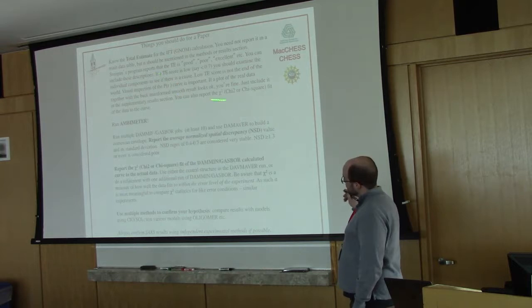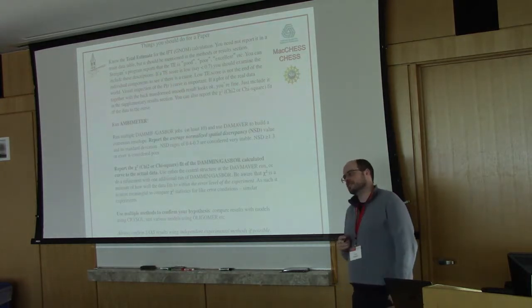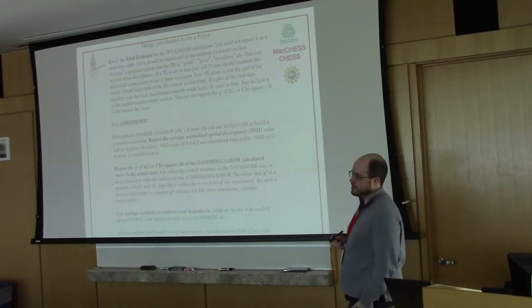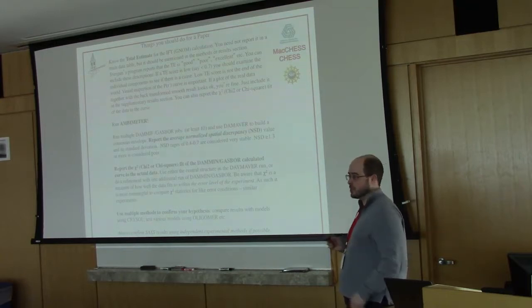But determining a good P(r) function is, I hate to say it, almost more of an art than a science. There's a lot of little interpretation calls you have to make, so it's a challenging piece to get absolutely correct. And as Tom said, that often leads to large uncertainties in Dmax, 5–10% or more.